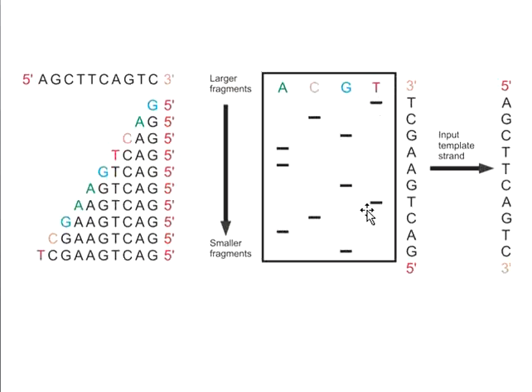Once we get the separation of the DNA bands according to their length, we compare the DNA bands in adjacent wells. First we determine which one is the lowest band and in which well it is found. In this case, our lowest band is found in the G well. In that well, all the DNA products have lengths that were terminated whenever dideoxyguanosine triphosphate was added.